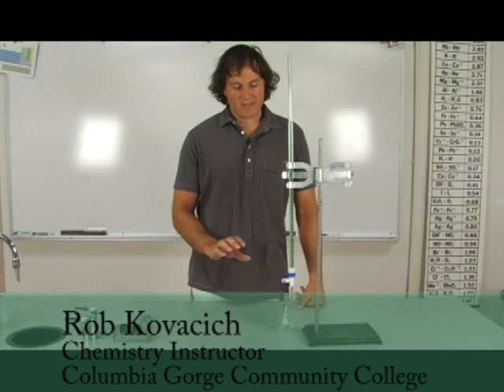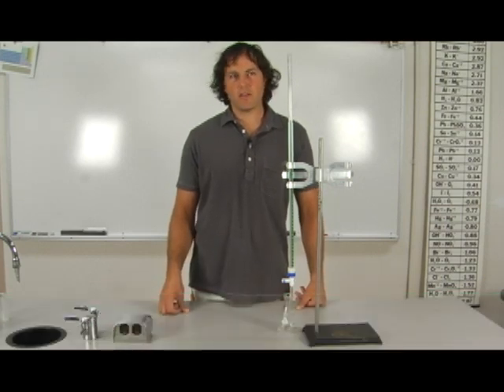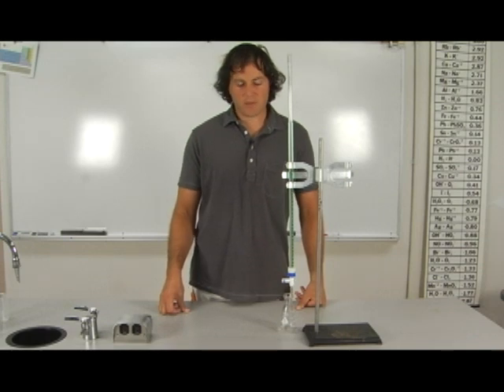This is a demonstration on how to use a burette. A burette is a device used for accurate measurements, usually in a titration experiment.